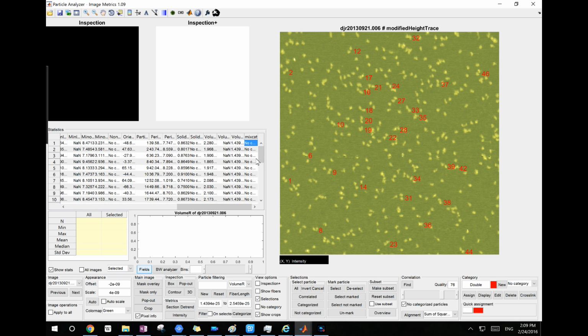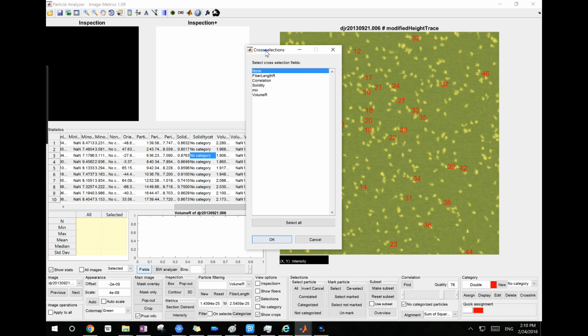So the other way to access the crosslink function is to just click one of these cells and say filter multiple columns. If you click the cell that's the category cell, which are mainly the cells that have character names instead of the numerical name. If you click one of these category cells and click filter this column, or filter multiple columns, it will go back to the crosslink section.